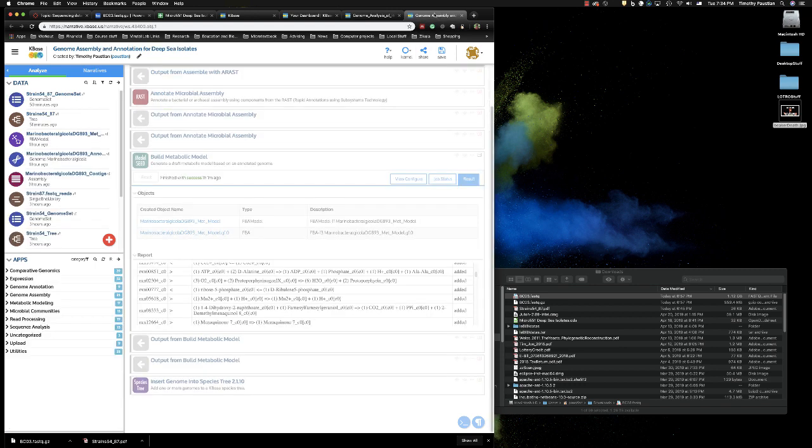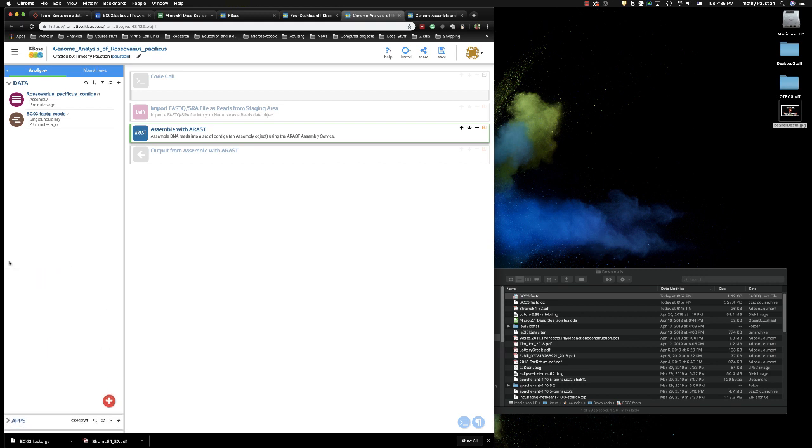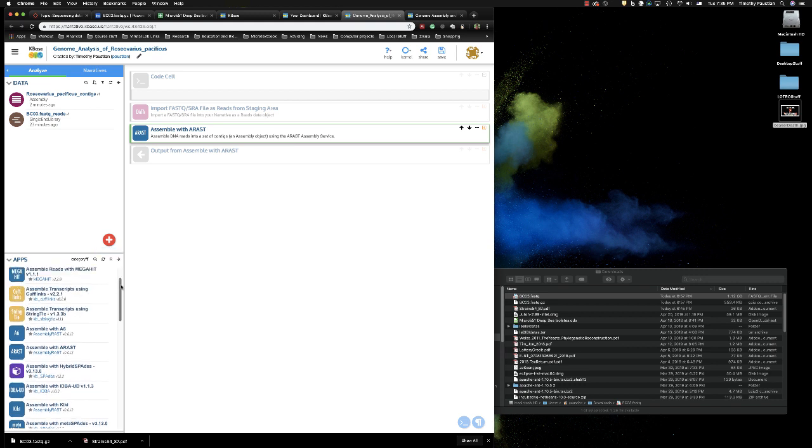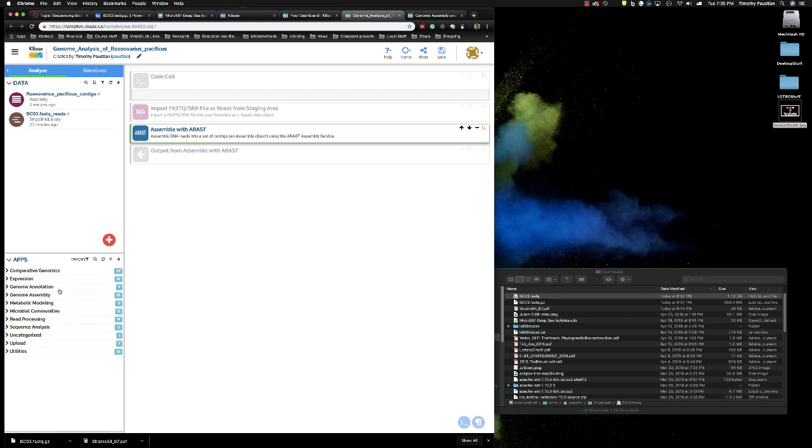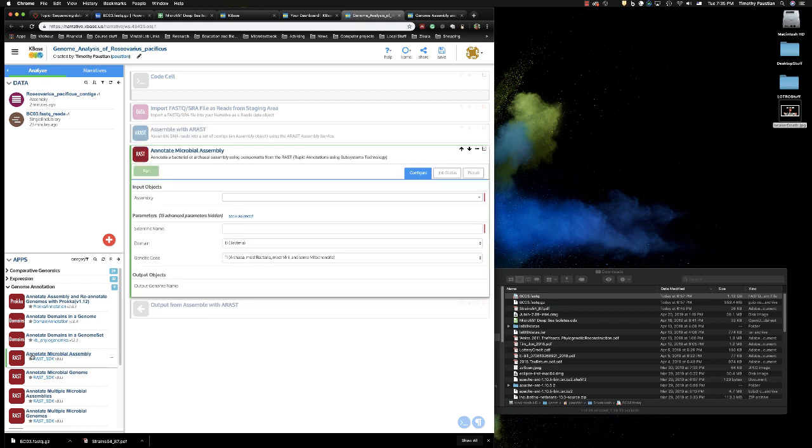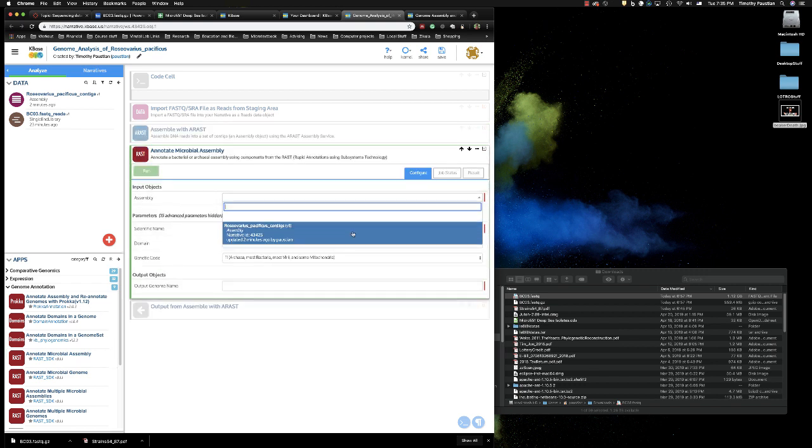Our next step is to annotate our microbial assembly. And this is very similar to what we did before. Again, we're going to use RAST, this RAST function type. And what this is, is the RAST function just is like really smart people who do this kind of stuff a lot have figured out, okay, these are the ones that work the best. So let's put them together and then decide. So we're going to use RAST, annotate microbial assembly. Click on that.